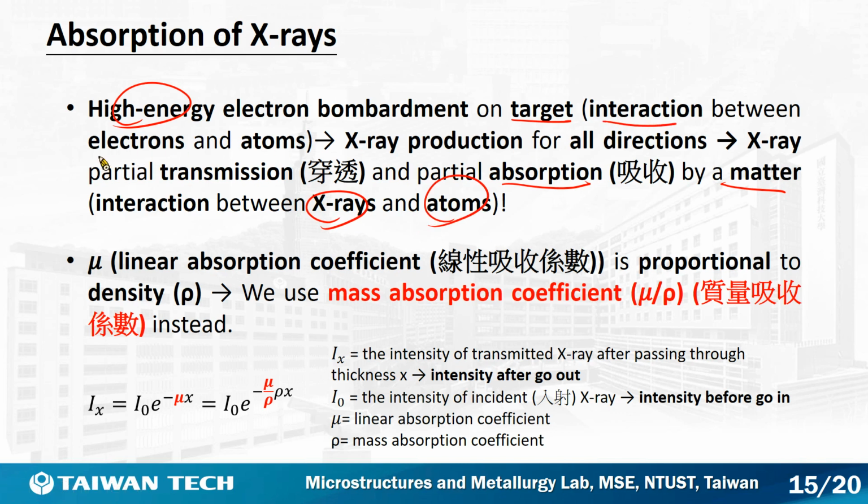Now let's talk about a concept we call mu, the linear absorption coefficient. This absorption coefficient is proportional to the density. So let's first try to see these equations.